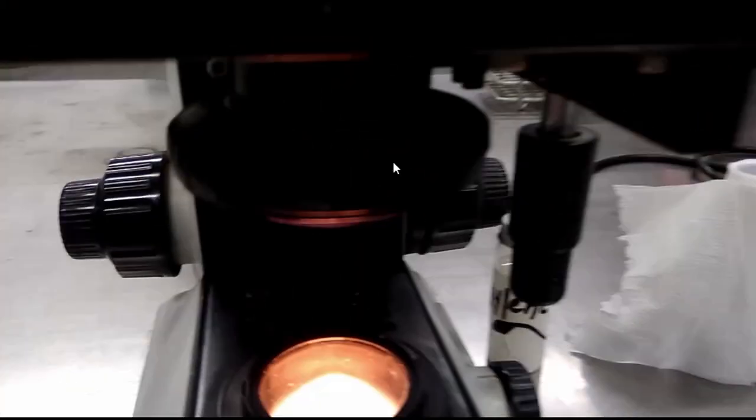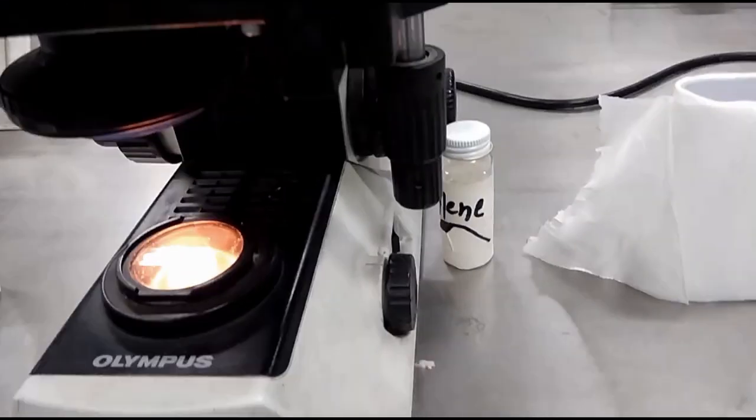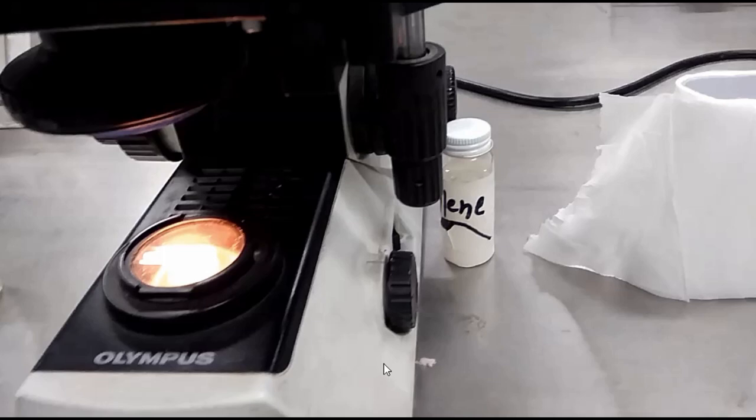Okay, in this way you became able to know the parts of the compound microscope in brief. Yes, this one is the foot. First, this was the electric supply from the main switch. This one is the switch of the microscope and this is the light adjustment knob. In this way we can adjust the intensity of light and this light is passed this way. This is the aperture and this one the condenser.